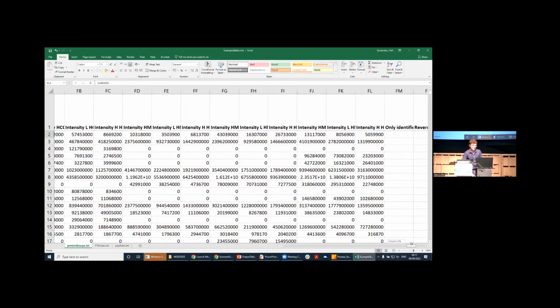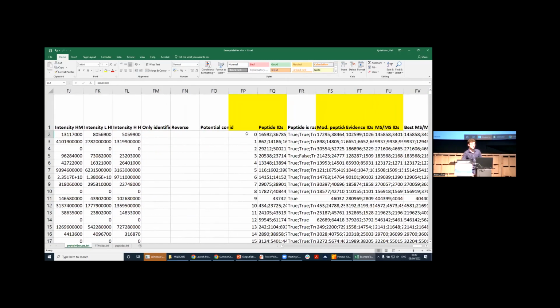And then in the end, what we have is one ID per group. So how we do matching between different tables in MaxQuant or Perseus is basically every protein group and every peptide and so on gets a unique identifier for our experiment. So it's basically just numbered. So here this is identifier 0, 1, 2, and so on. And then every peptide has the same.